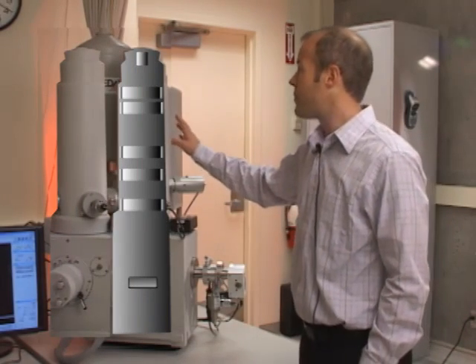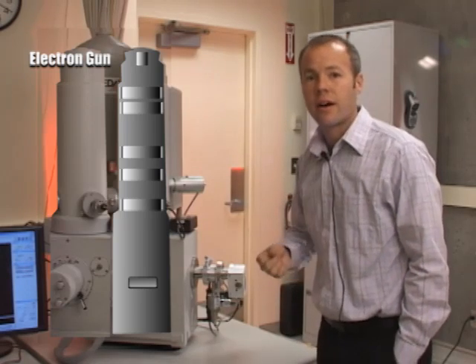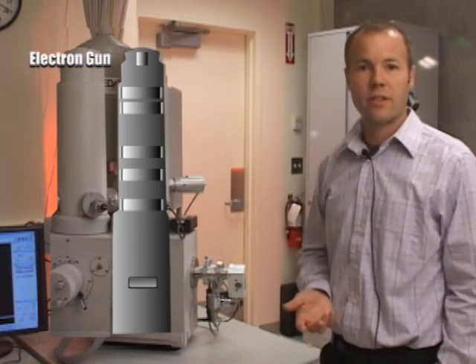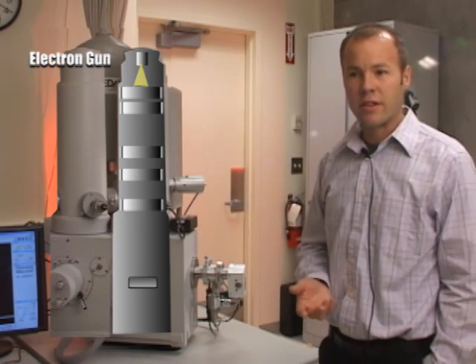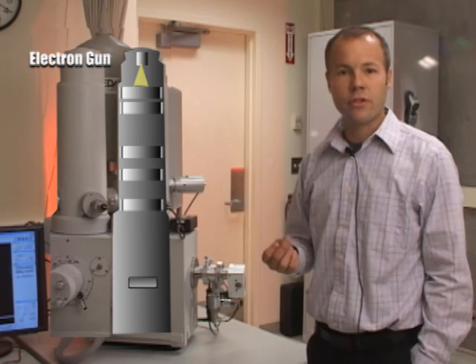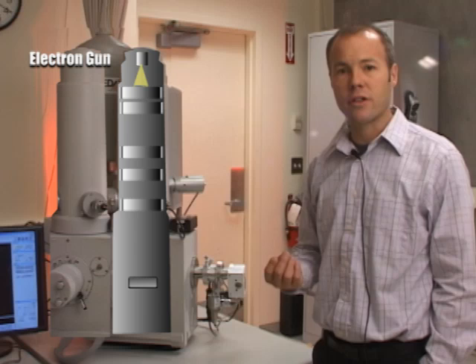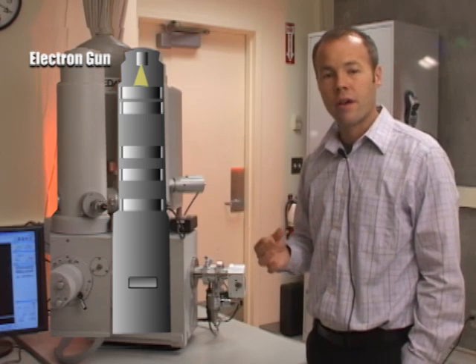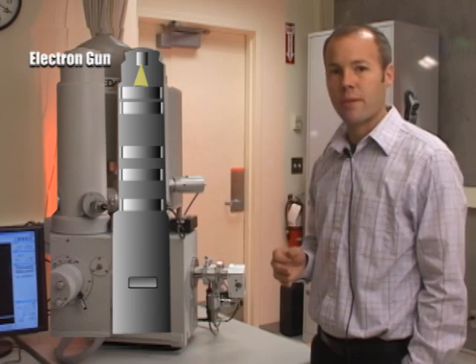At the top of the column is an electron gun. This is a field emission scanning electron microscope, so the electron gun is essentially a very sharp tungsten filament. We use a strong electric field to draw a current off of that filament, and that creates the probe beam that we use to impinge on and image the sample.